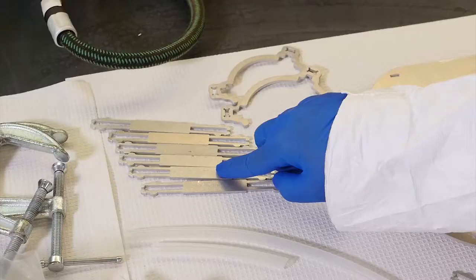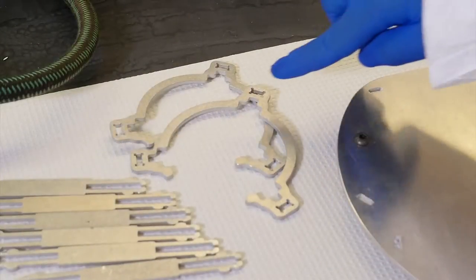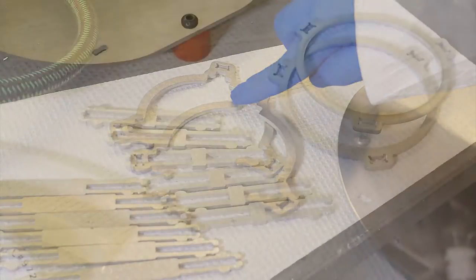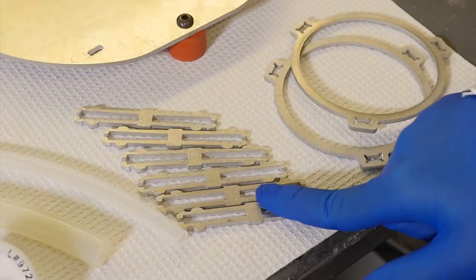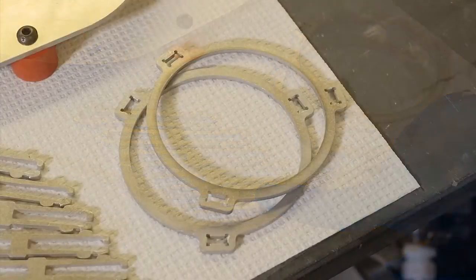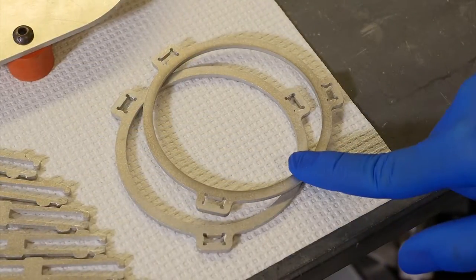Components include tall legs for the filter stand, semi-circular pieces for the filter stand, short legs for the collection cup stand, and circular pieces for the collection cup stand.